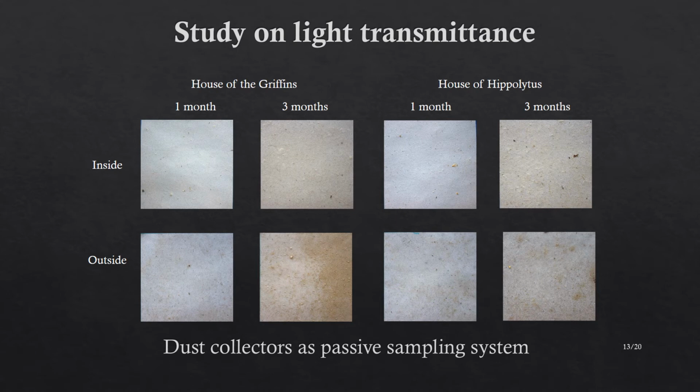In previous cases, the quantification of the particles was undertaken using a microscope of high magnification, visually or by automated image analysis prior to converting the pictures to binary format. Instead, the use of light transmittance in this study significantly reduces the processing time and takes into consideration all particles, not only the dark ones.